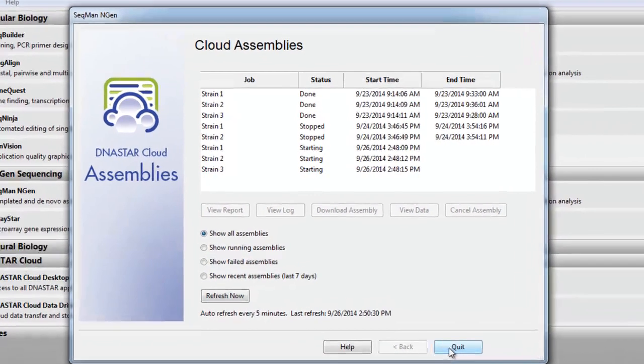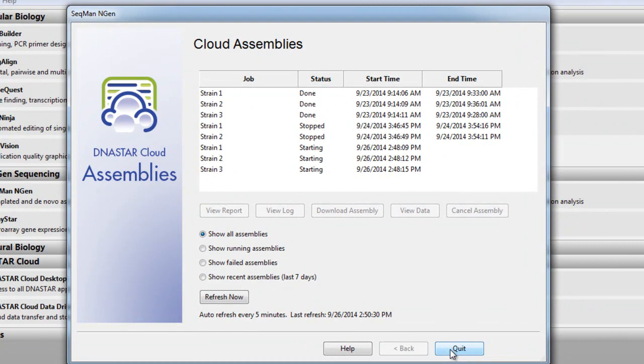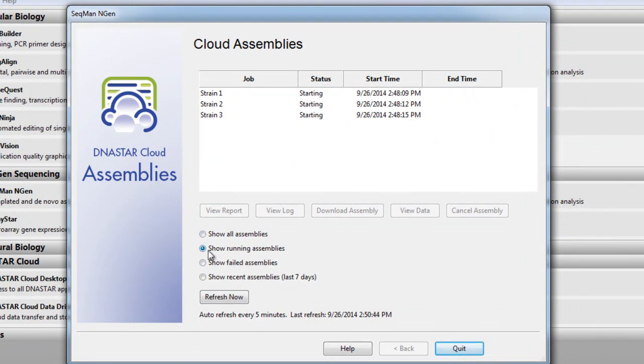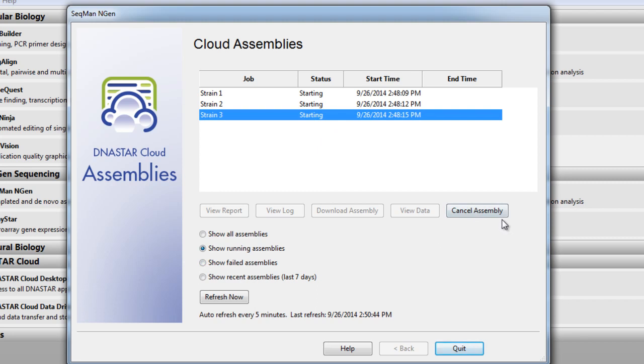So here we can then choose to look at all our assemblies, only those that are running, ones that have failed, and other recent assemblies. We can also choose to cancel assemblies that are running from this screen if desired.